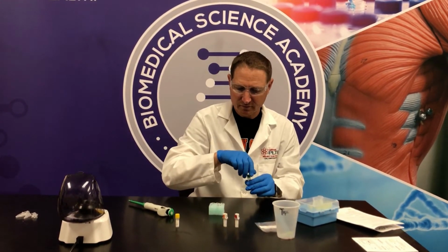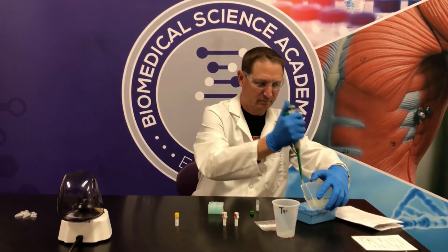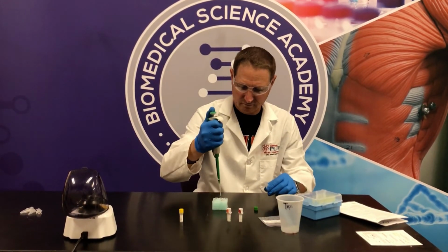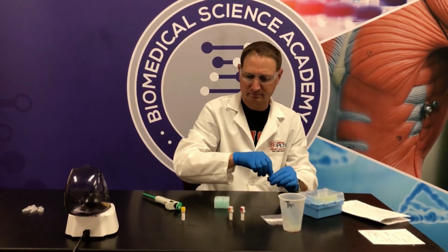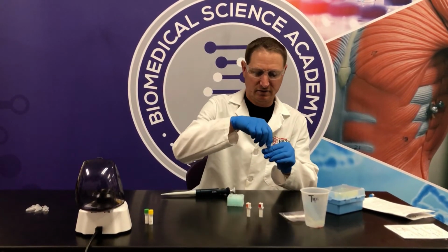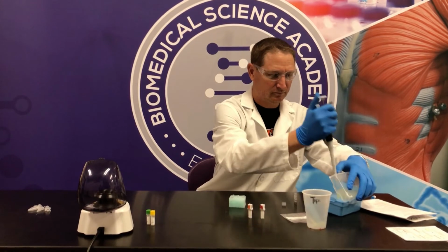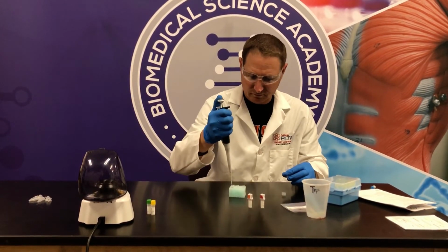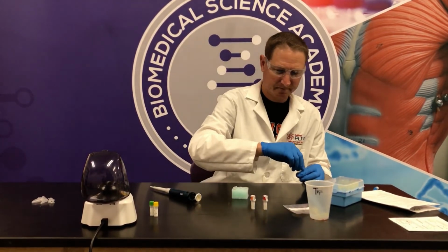Missing person number 2 is going to go into the one that I have labeled 2. Dispose of the tip and cap it. Now I'm going to take my dilution buffer and I'm going to put 14 micros into the tube that's labeled dilution buffer. I'm going to cap both and set this aside.